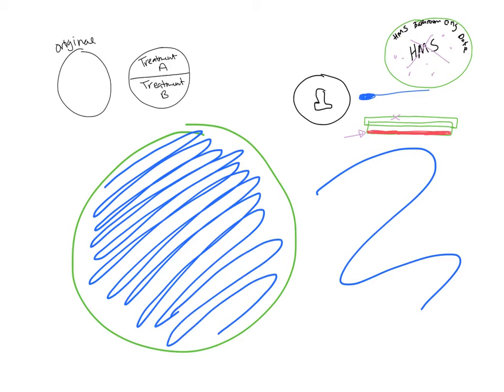And so then you put the lid back on. After you've cracked the lid open, you spread across the bottom. You don't want to gouge into it because it's a little bit harder than Jell-O, but it will crack and get gouges, and that will make your bacteria grow all crazy. They'll grow in the cracks and it will be difficult to tell what's going on. So you just want to gently spread it across the top, then close the lid again and throw your swab away in the trash. So that's the original plating, and that can go on here.